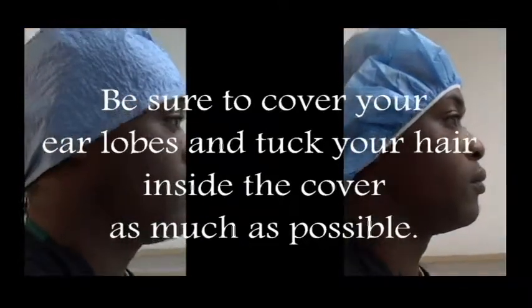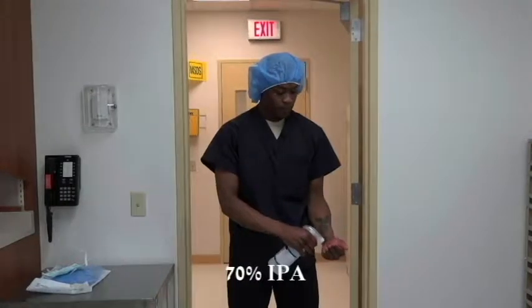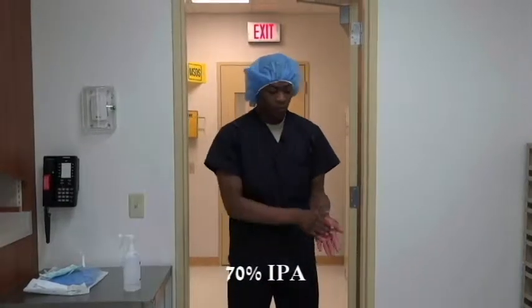Once again, be sure to cover your earlobes and tuck your hair inside the cover as much as possible. Sanitize hands with 70% IPA.